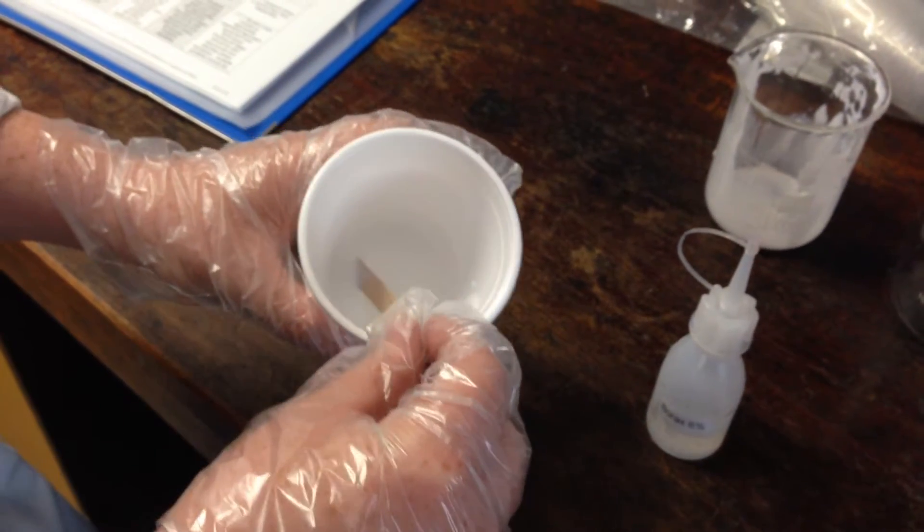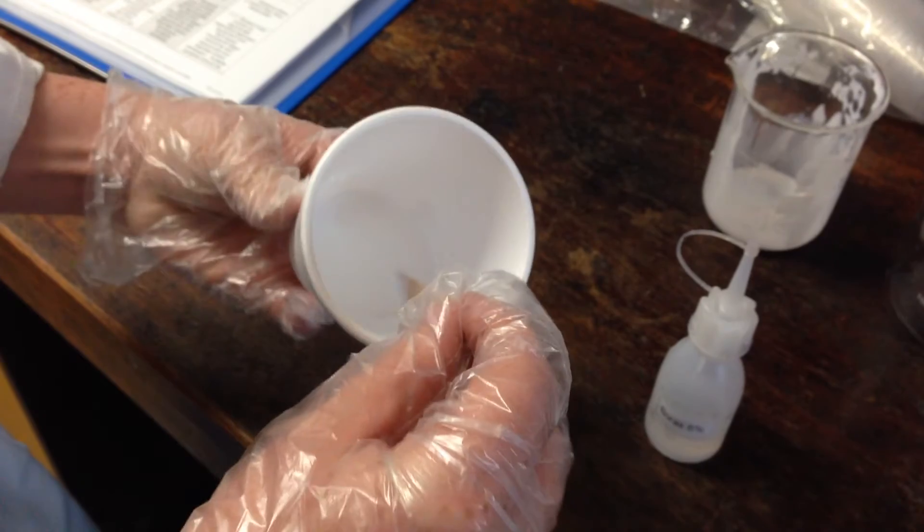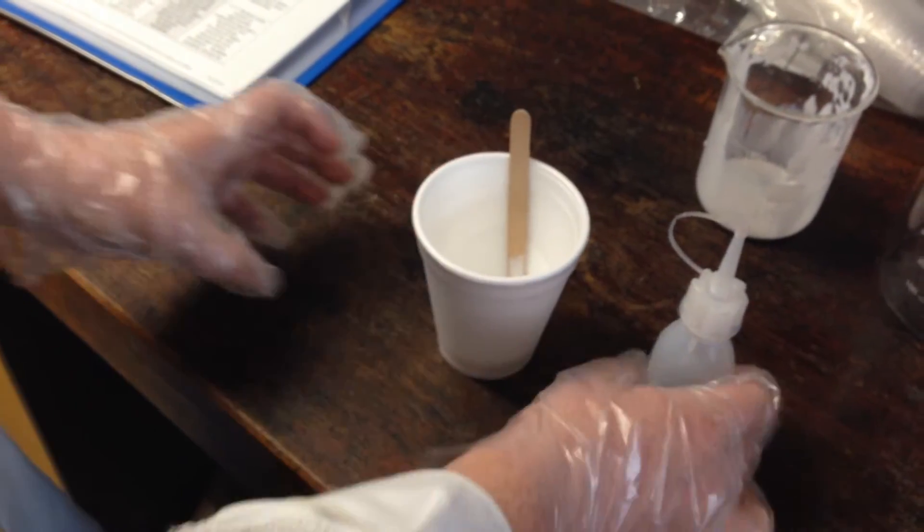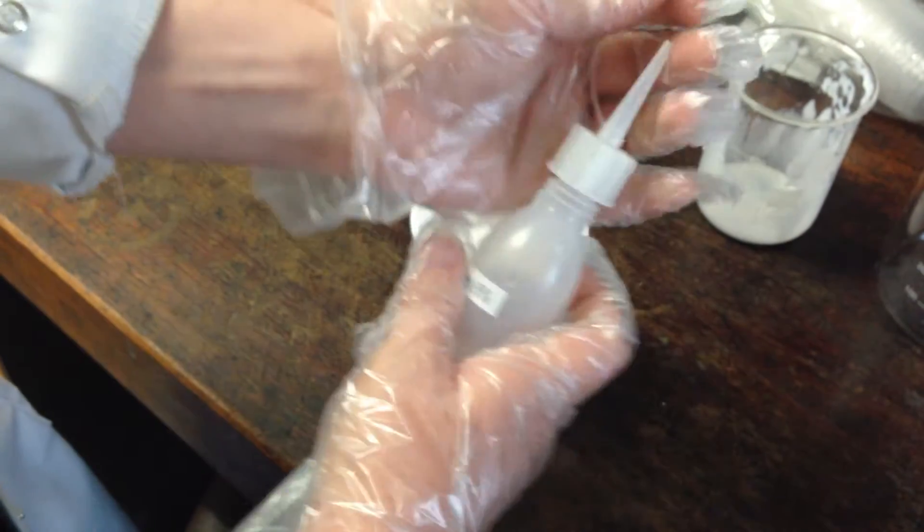So in this practical, we're going to be looking at polymers and cross-linking. Here I have some PVA glue and water, just a polystyrene cup with some plastic, and here I have some Borax solution.